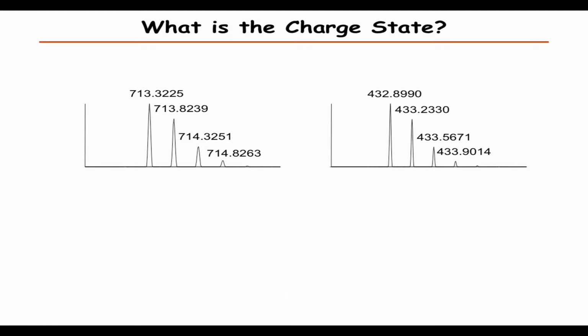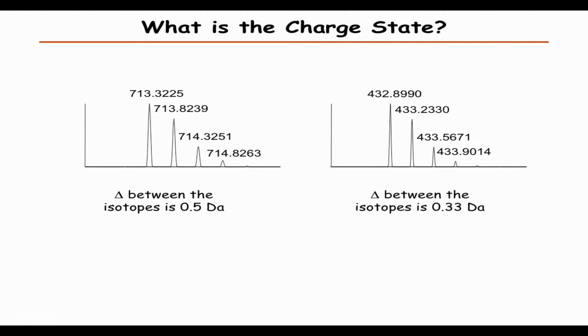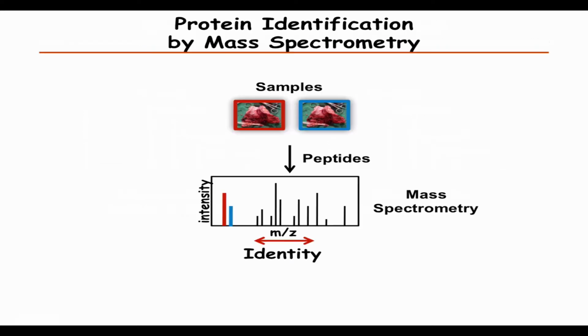Yes. So as you see here, we have 0.3 here and 0.8 here. So there's a 0.5 difference between these, so it's a 2 plus. And then here we have a 0.3. So that's the reason. This is something that is used, of course, in software.